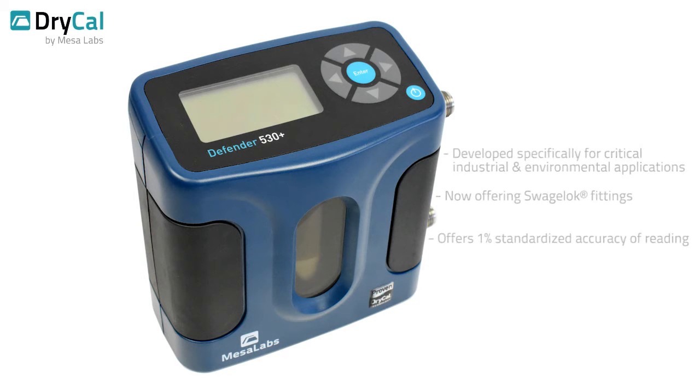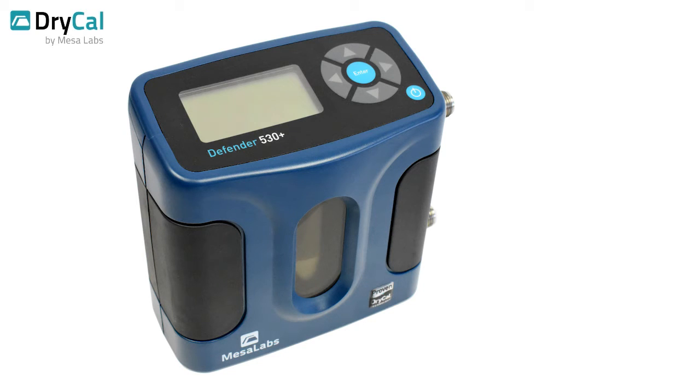Unlike other gas flow calibration technologies, the Defender 530 Plus's positive displacement operating principle provides immediate primary measurements of actual volumetric gas flow rate, accurately and independently of gas type.